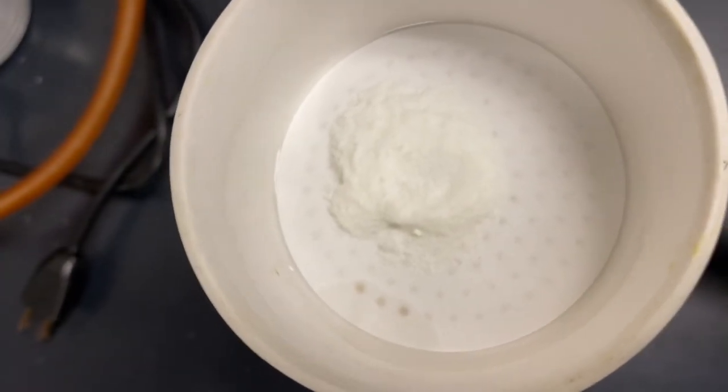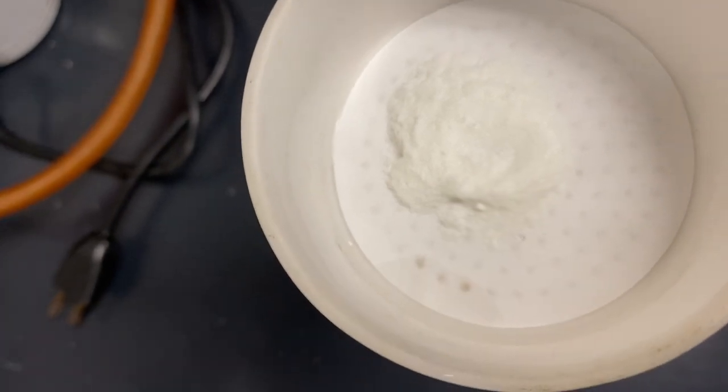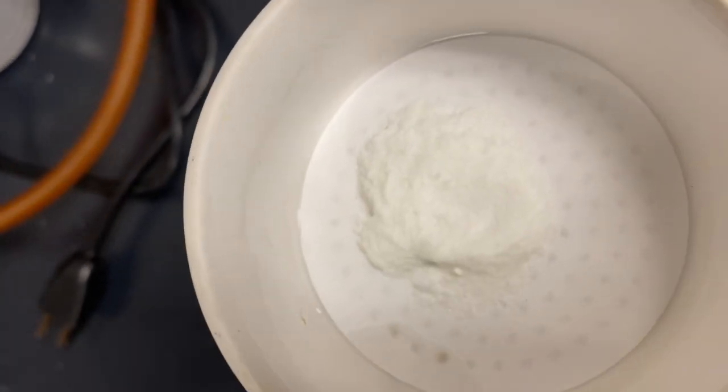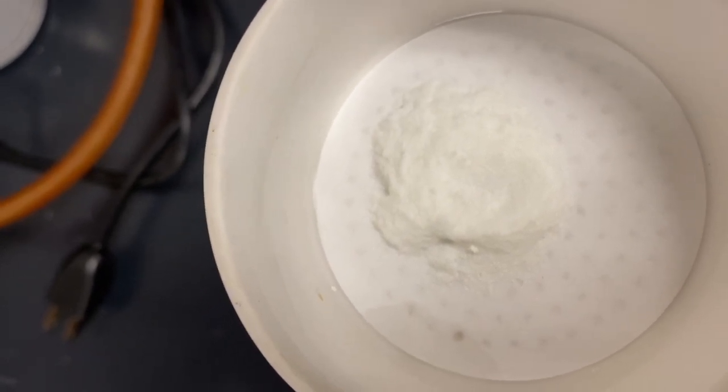But as you can see, we started with a little yellow tint to our product, and now we have obtained a much purer product as indicated by the lighter color.